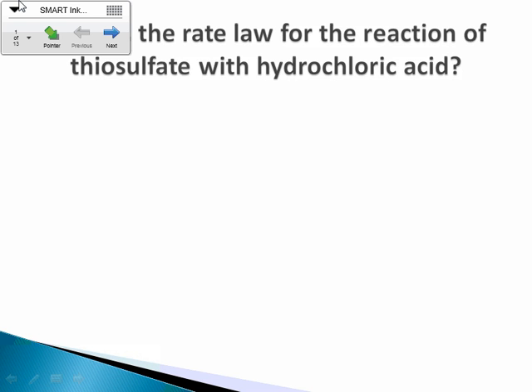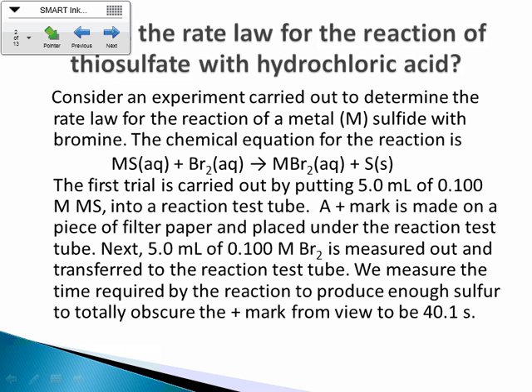So we're going to find out the rate law for the reaction of thiosulfate with hydrochloric acid, okay? Before we do that, let me look at the lab and see how much intro we've got here. Where did I put it? There we go.